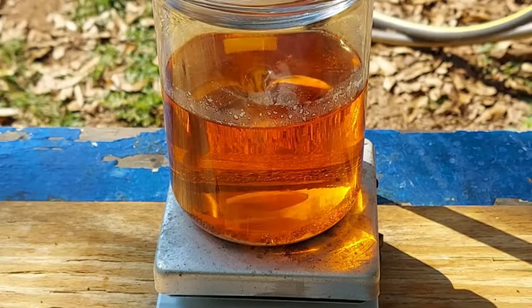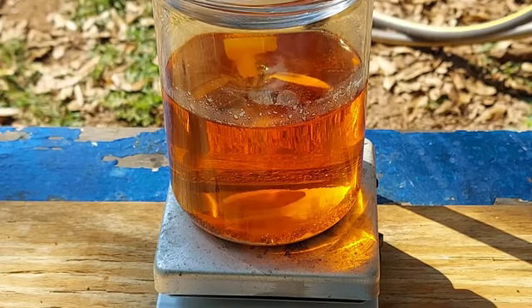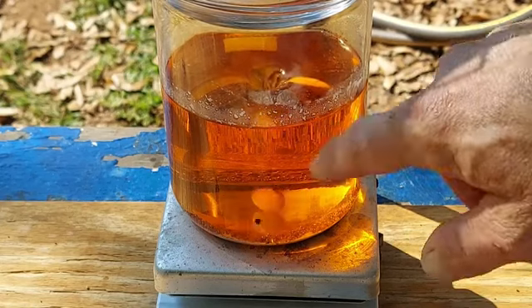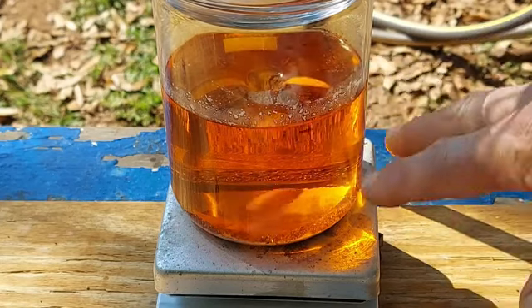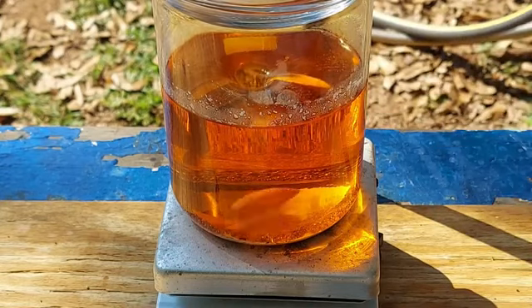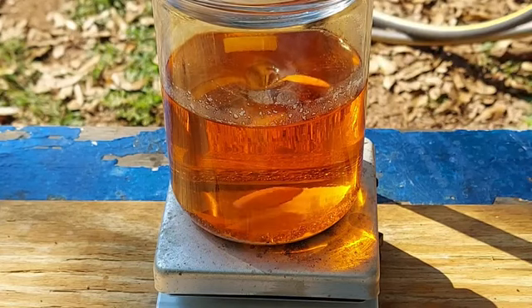Anyway, it doesn't really matter. In the end, all we care about is that it all got oxidized and it's all in solution. The little bit of crust that's on the side here, the vapor will start to get that. I'll just put the cap back on this thing. So we'll let it warm up here and just keep going.